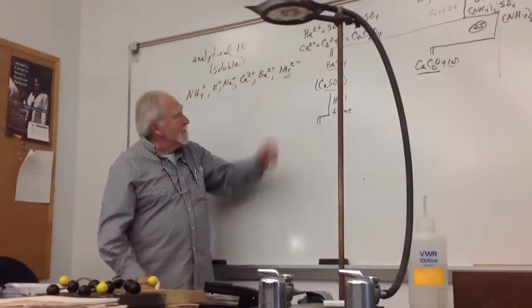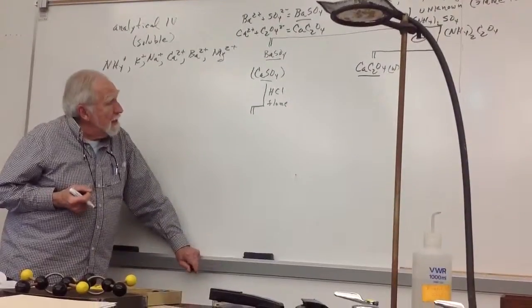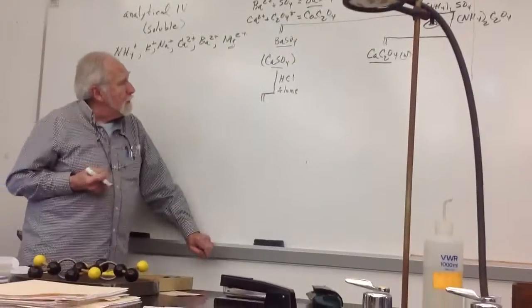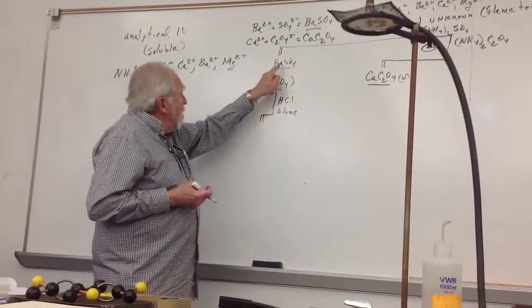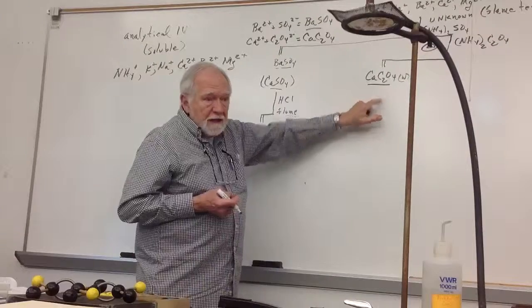So here the same thing. If I'm asking about calcium, I expect to see calcium, not barium. Okay, so that's the precipitate. And again, you can do the flame test, because if you didn't get rid of all the barium at this step, barium oxalate also precipitates.